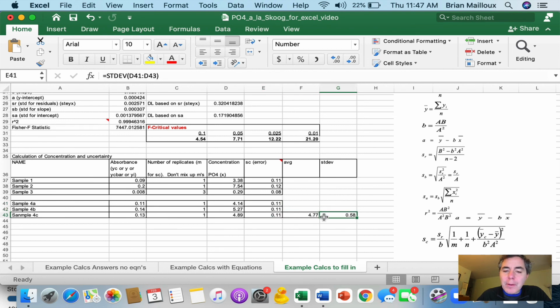I like these better usually because this is where you actually ran 3 samples together. So look, you have 3 samples, 4A, 4B, 4C. This is telling you your true errors, which take into account everything: collecting the samples, running them, etc. So that's a much more comprehensive way of doing error.